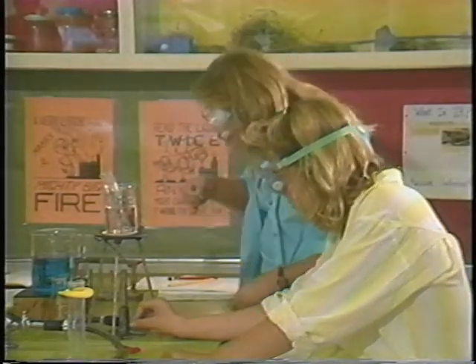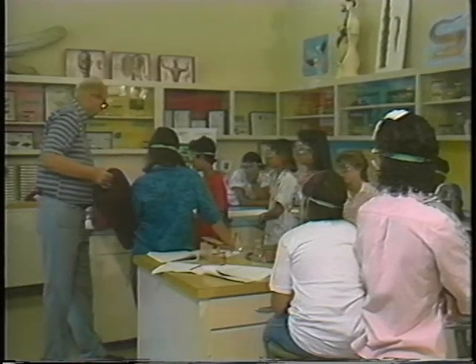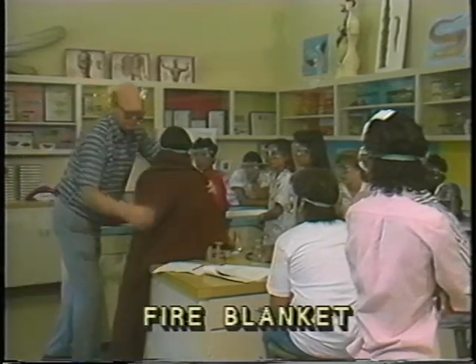Now, most safety rules are just common sense. For example, you don't want to throw a hot match into a trash can. You could have a trash can fire. Instead, put it in a glass or metal container or douse it with water. Know where all the emergency equipment is in your room and learn how to use it. This includes eyewash fountains, fire blankets, extinguishers, and alarms.